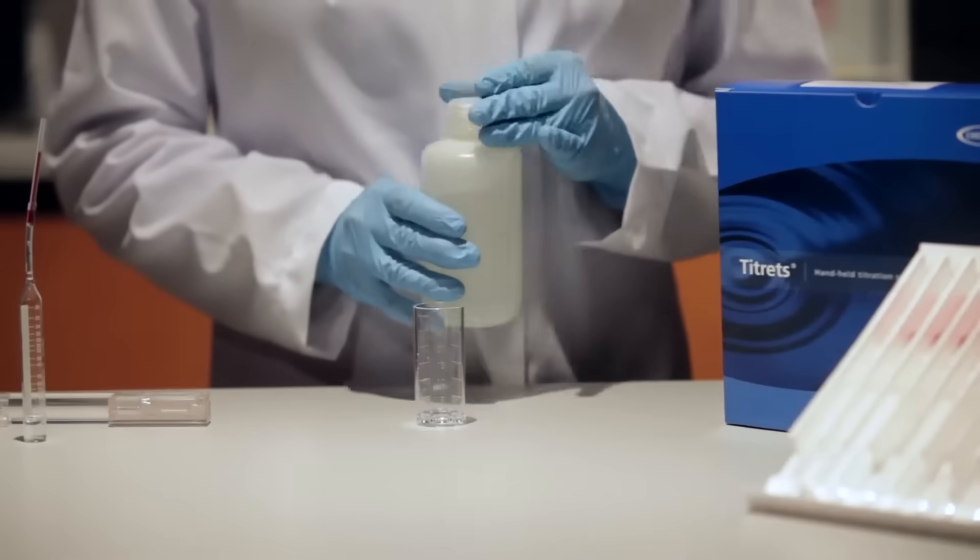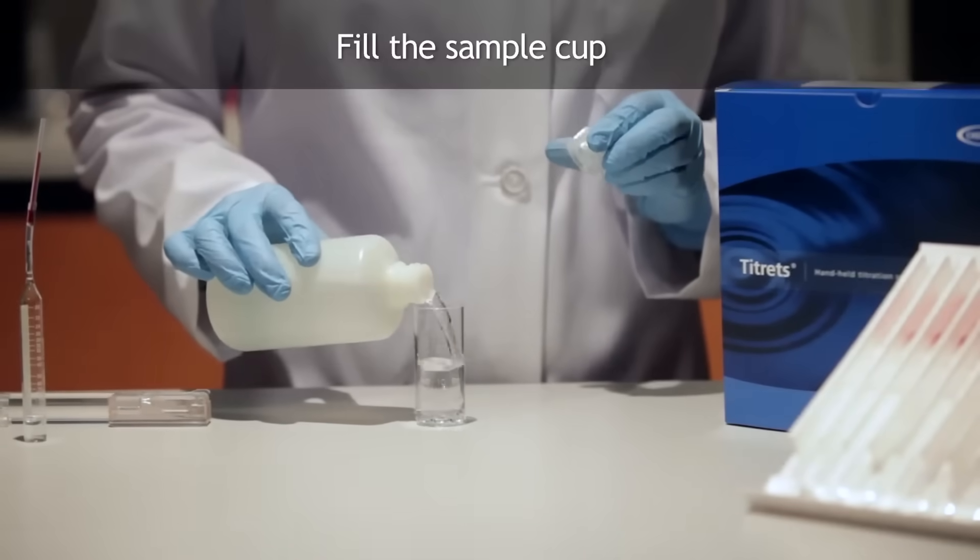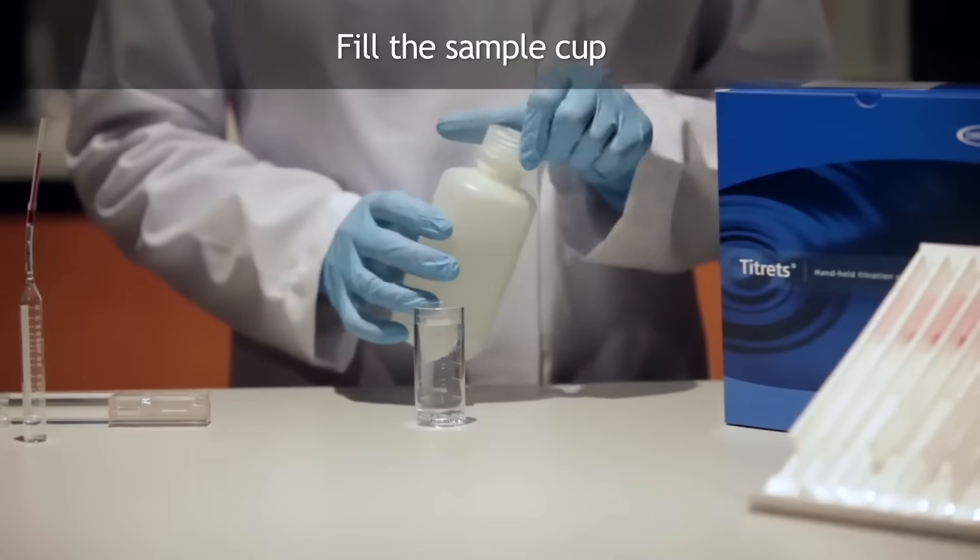To perform a total hardness test using the Titrets method, fill the sample cup to the 25 milliliter mark with the sample to be tested.